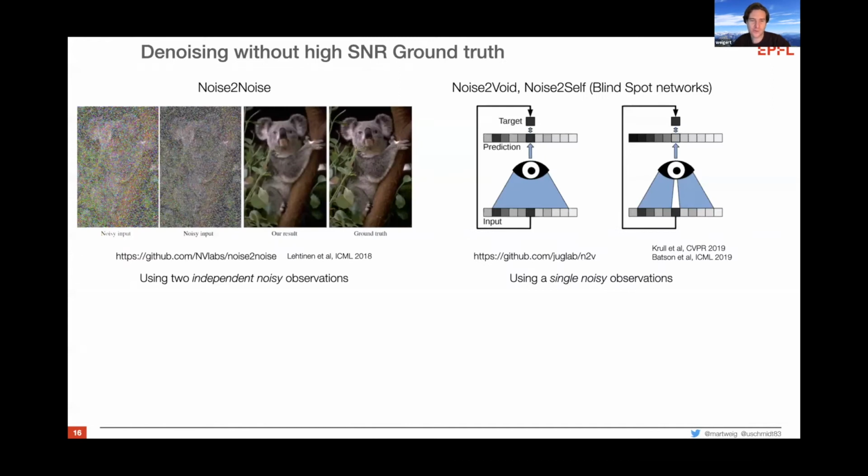Okay, of course, so far you always needed, yes. Yeah, I had a quick question. I guess I missed it. So for the network, what do you provide? Do you have to provide annotated ground truth, or just a high resolution ground truth, or just start from the noisy one?